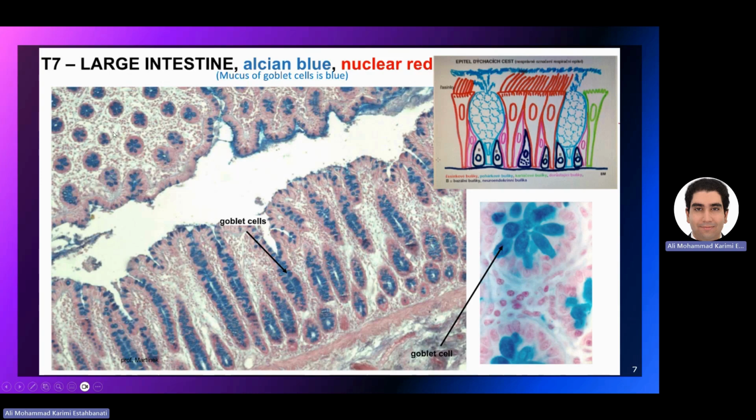But if you see a cross-section of the small intestine, guys, you will see the same thing. The difference is that between these flower-like structures, there will be white, meaning there's nothing connecting them. So it's small intestine. Pay very close attention to it. This is like a free question if they give you this in the final exam. They gave it to me in the final exam, and it was one of the best things I could ever ask for.